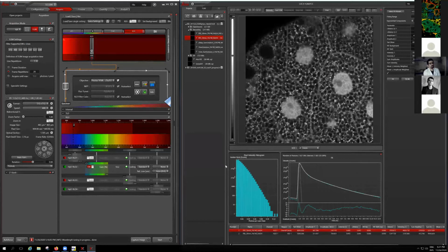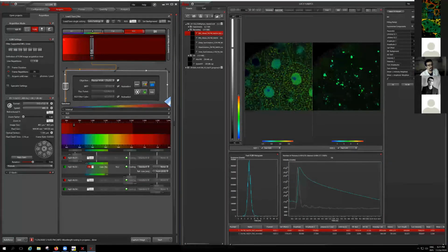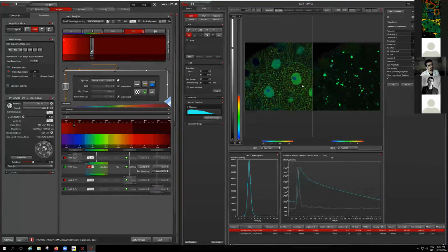Okay, so say that we are going to do some analysis and just showcase that there isn't much to discuss here. This is the actual measurement that I showed the video of, how it was recorded. What we do, first of all, we need to discard the nuclei, and also these parts.